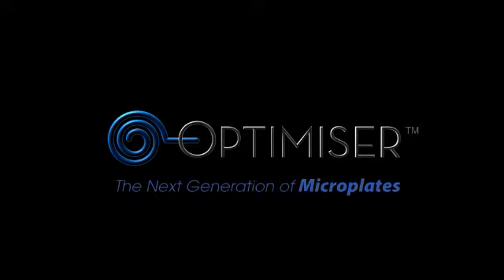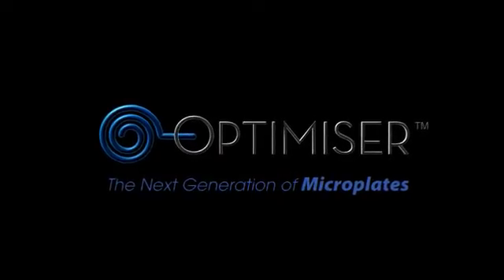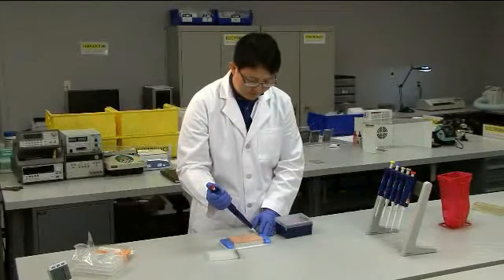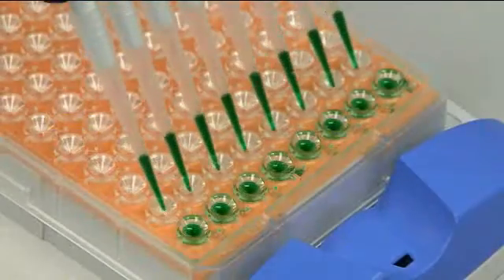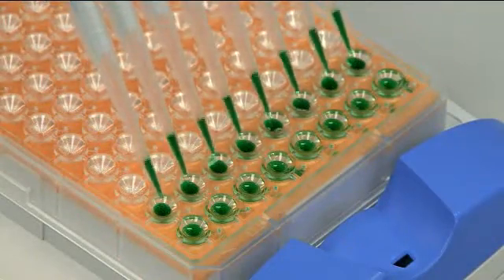The Optimizer is a revolutionary microplate design that can significantly enhance assay performance. The operation of the Optimizer is very similar to a conventional microplate. However, it is important to follow correct protocols for using the Optimizer.